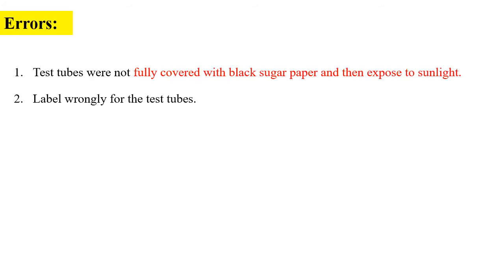Regarding experimental errors: the first error is that test tubes were not fully covered with black sugar paper. If not fully covered, they will be exposed to sunlight — you need to think about why that is problematic. The second possible error is labeling test tubes wrongly or mixing up the solutions.